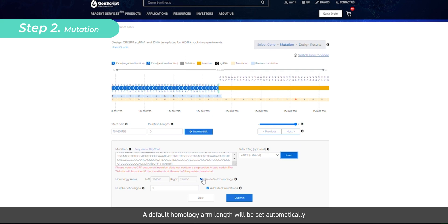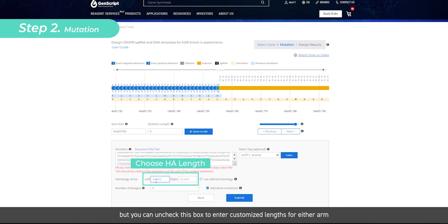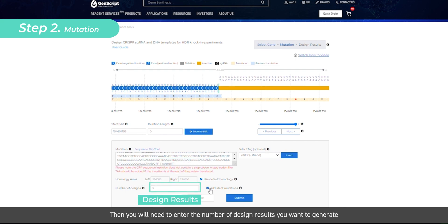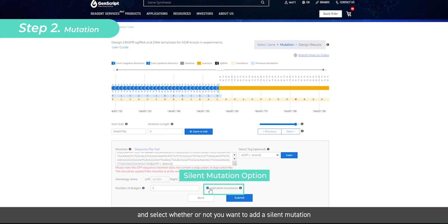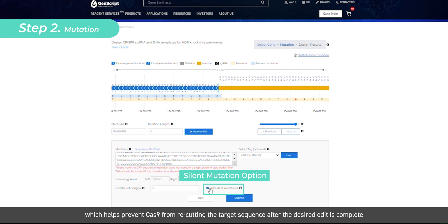A default homology arm length will be set automatically. You can uncheck this box to enter customized lengths for either arm. Then you will need to enter the number of design results you want to generate and select whether or not you want to add a silent mutation which helps prevent Cas9 from recutting the target sequence after the desired edit is complete.